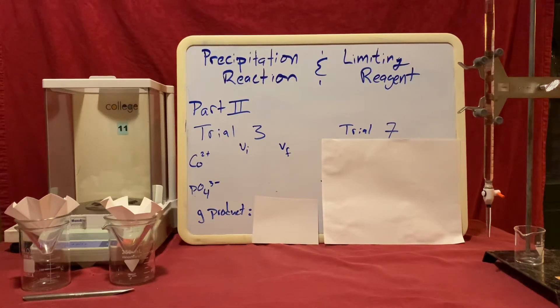In this video we'll be looking at part 2 of the precipitation reaction and limiting reagent lab. In part 2 we collect data from a series of different trials, and in this demonstration we'll be looking specifically at trial 3 and trial 7.